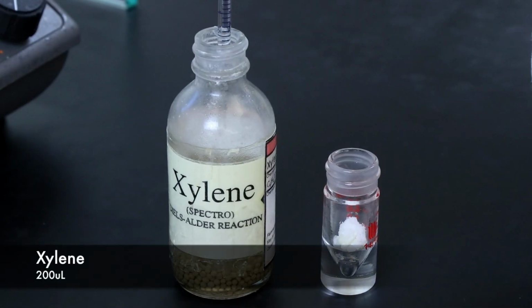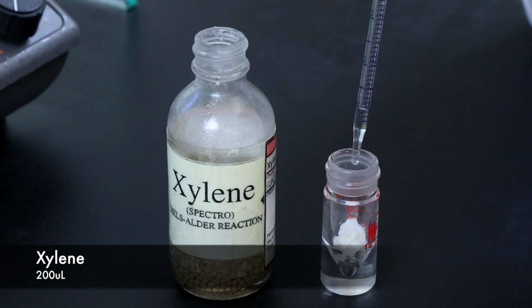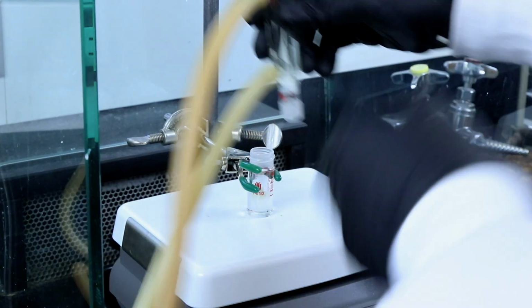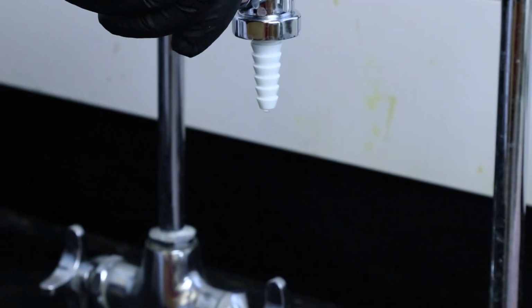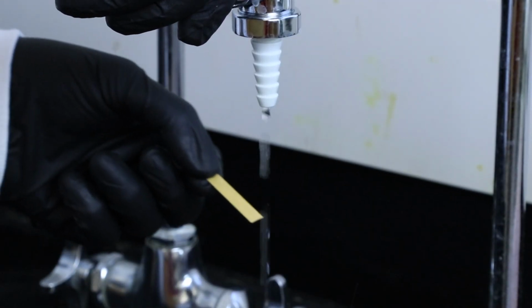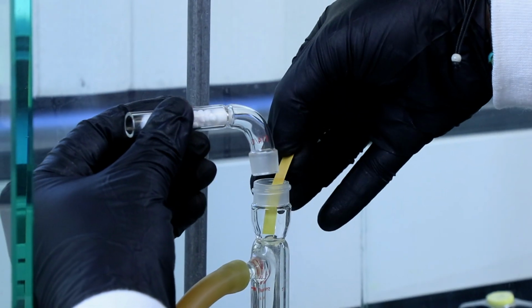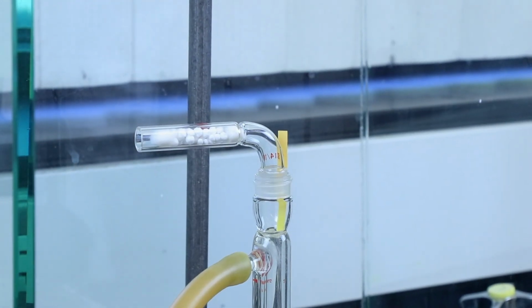Then lastly, I'll add 200 microliters of xylene to the conical vial and start setting up the apparatus. But before adding the drying tube, I'll moisten a pH paper with some distilled water and place it in the water condenser like this so that I can test the pH of the vapors.